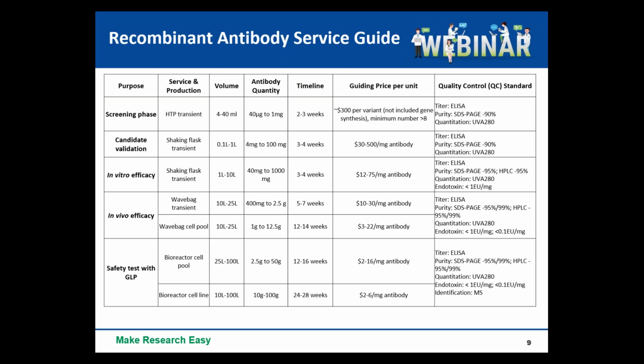Now, since the talk is about high throughput antibody, we'll focus on how to measure the antibody developability using a high throughput approach and the considerations therein.